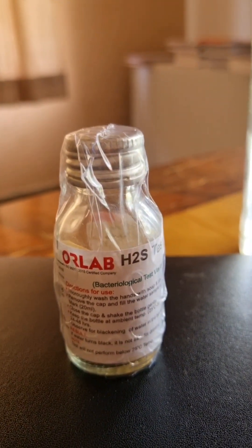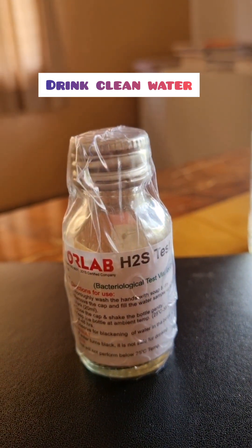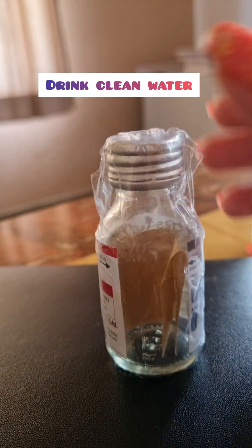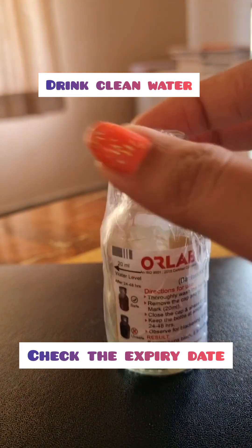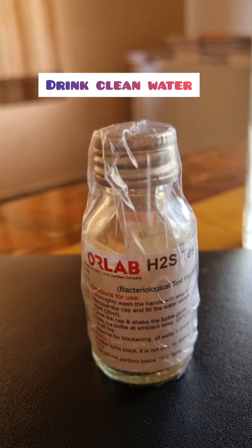Please do buy this. If your water has bacteria — like something from sewage or some pathogenic things — it will turn black. You should not shake it. If it's black, then you have to think before you drink.